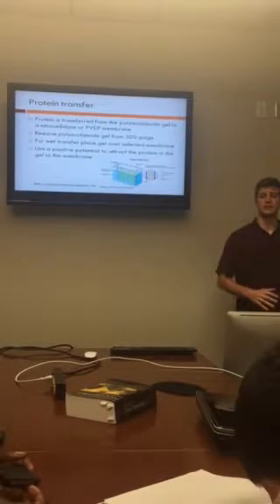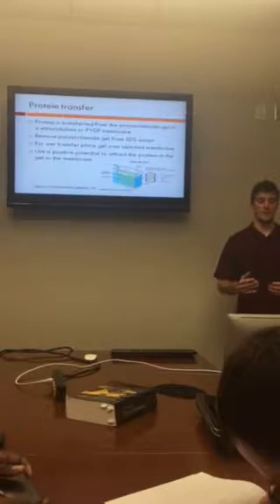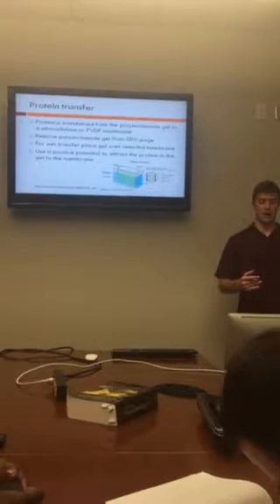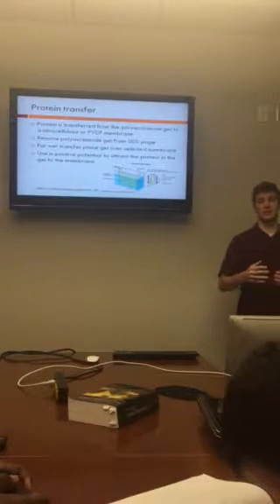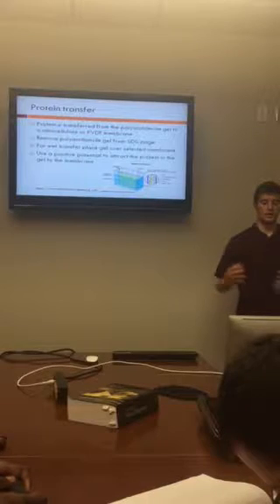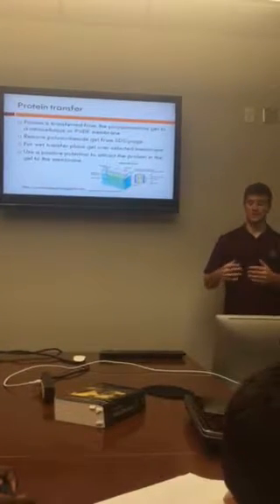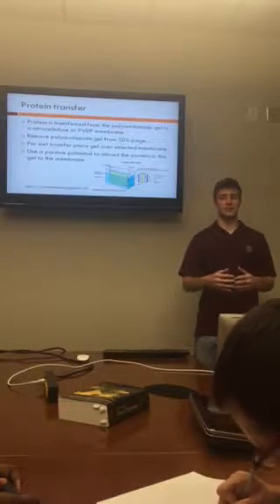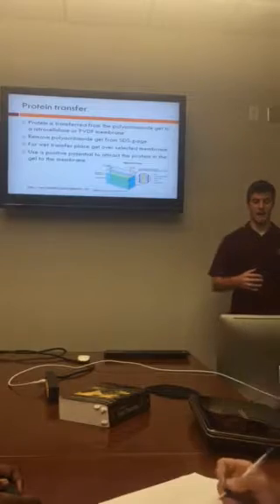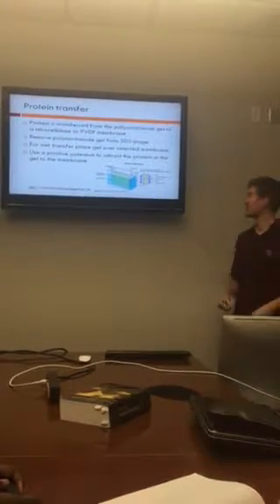After separating the proteins, it's important to transfer the proteins to another membrane. This is going to be achieved with this wet transfer method. You're trying to transfer the protein from the polyacrylamide gel to either nitrocellulose or PVDF membrane. To start this, you're going to have to remove the polyacrylamide gel from the cassette associated with the SDS-PAGE, and then you're going to place them in a wet transfer sandwich, is what they call it.